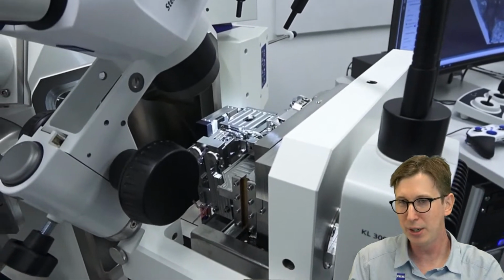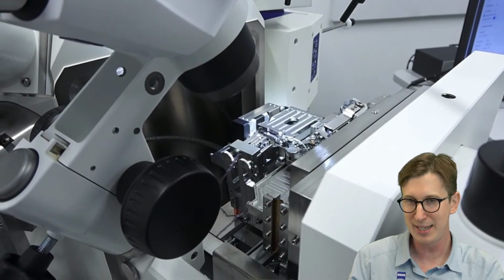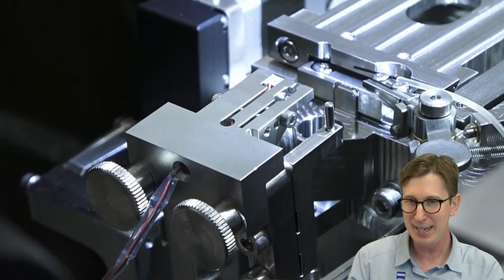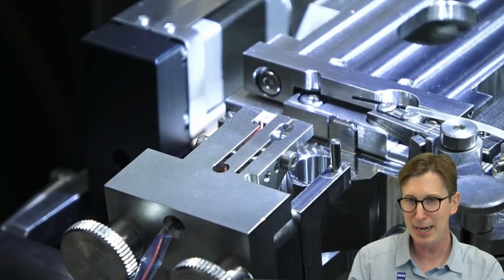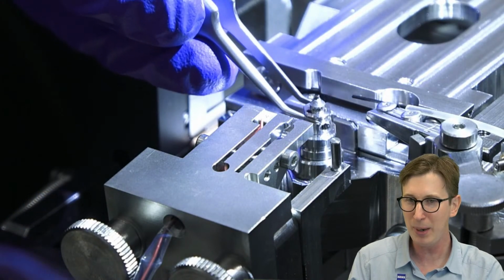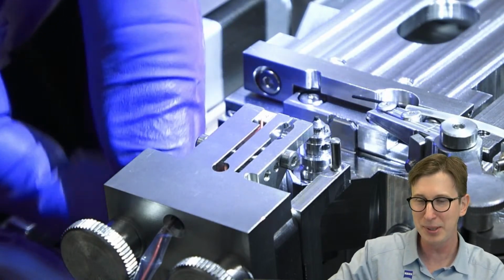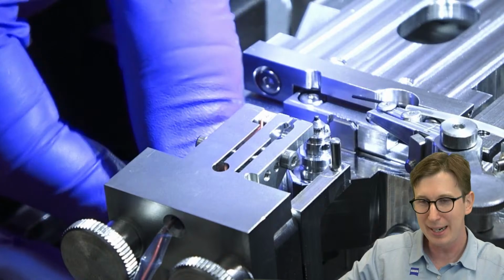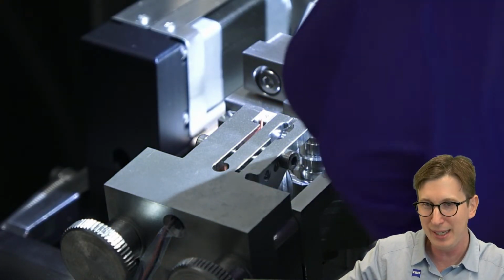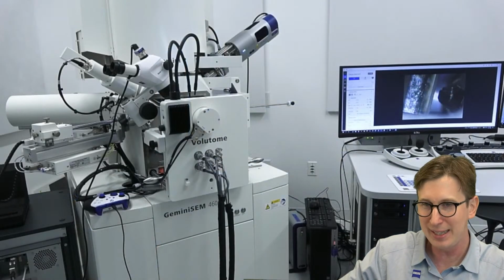Now, as I zoom in, you'll notice closest to you, you'll see the knife on the left-hand side. The sample pin isn't in yet. That knife is in its parked position. And now I can bring in the sample just like this. The sample holder has only one way it fits in, and this is making sure that the alignment I did is good. I have a simple hand-tightened screw that I am applying here to secure the sample. And finally, I'll place the focal charge compensation needle pointed directly at the sample.